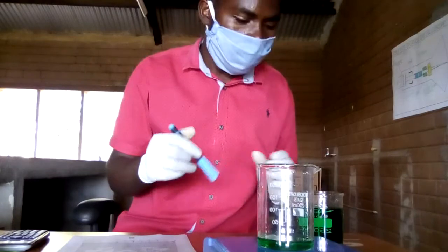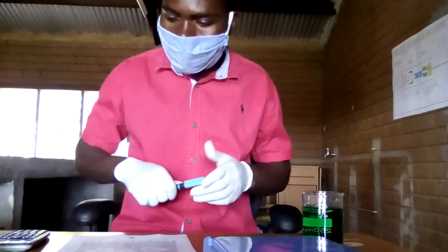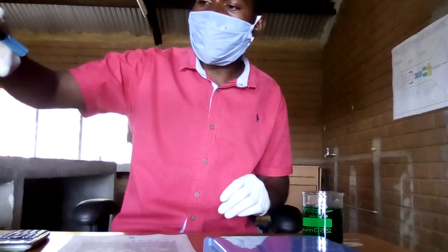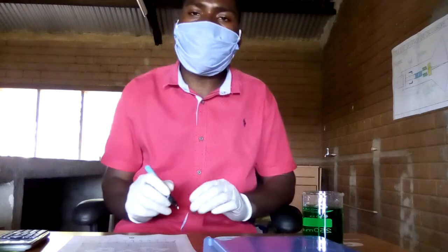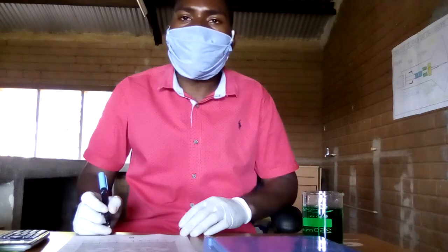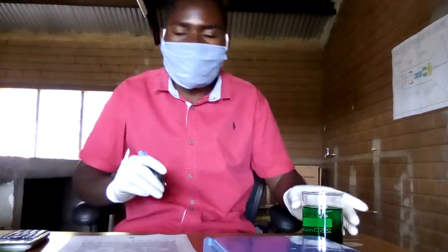122.1 grams. So this is what I've gotten. I'll write it, and then from there I need to subtract. Remember, the mass of the empty beaker is 102.1. So you just subtract the same number: 122.1 minus 102.1. The answer you find should be 20 grams.